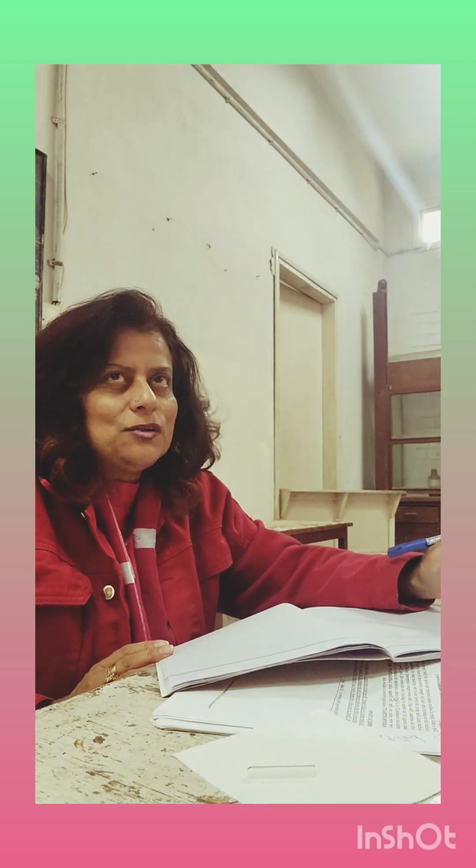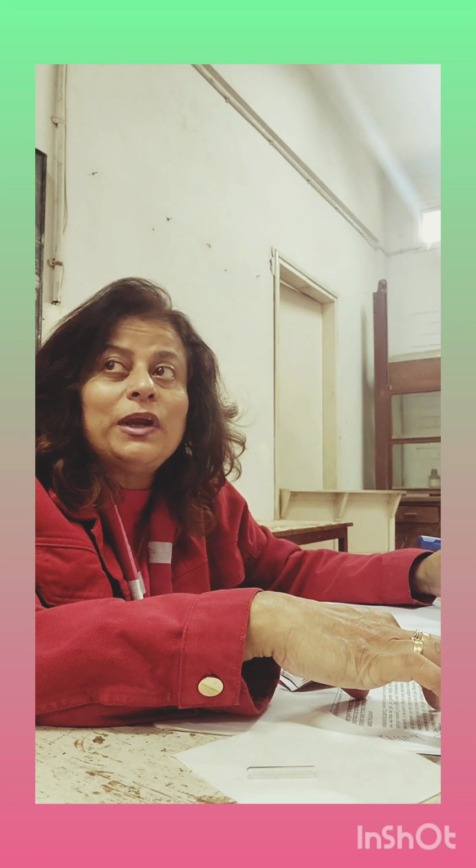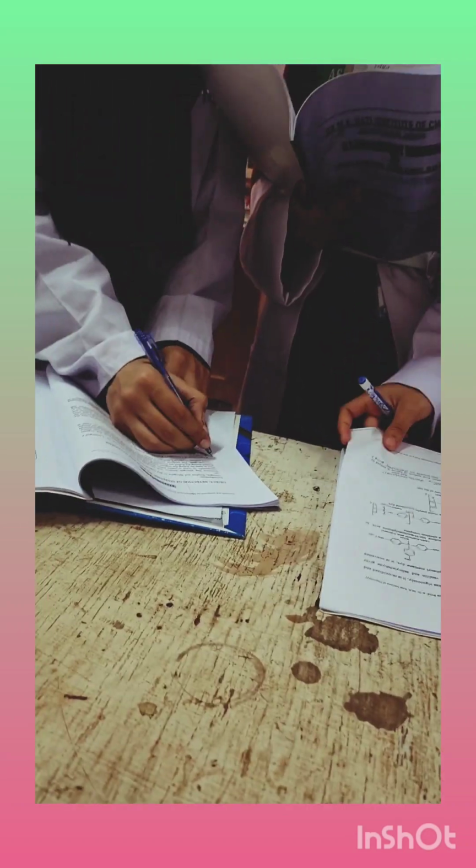Fine? So now, in the journal, you are going to write down the procedure. You will write down this whole procedure. You will not make any other heading. You will just make this heading, preparation of sodium extract, and you will copy down this method which is written over here. Now I would appreciate it if somebody will read. Start reading the procedure. Who is good in reading?